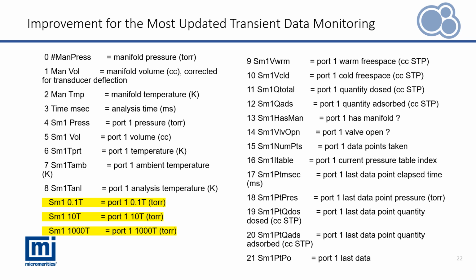This version records the pressure on all 3 pressure transducers and uses the best pressure reading depending on what pressure we're at. So if the pressure is above 92.5% of the top spec range of the most precise pressure transducer, it takes the reading from the next pressure transducer.